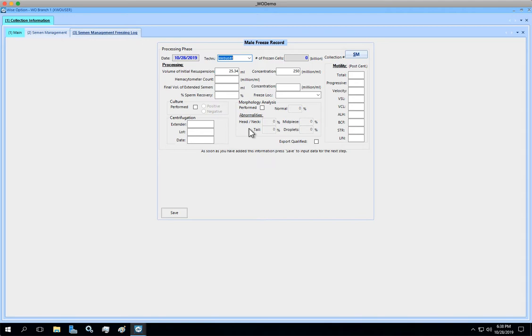Most of the records here are optional, so it depends on the information available from your equipment. I'm just gonna put from the NA location.